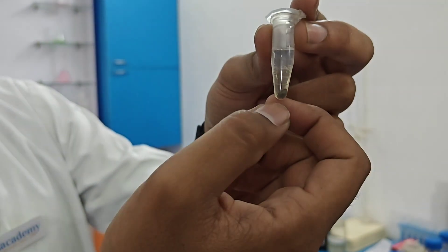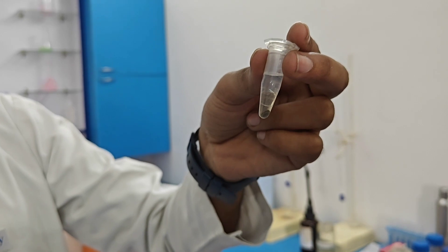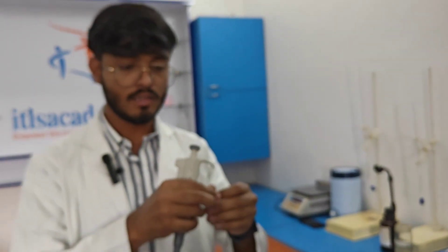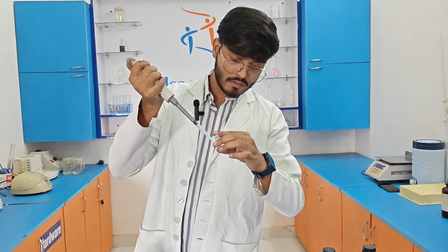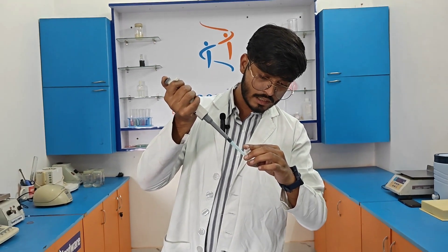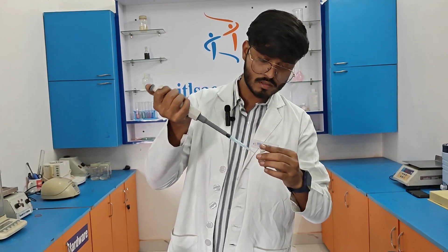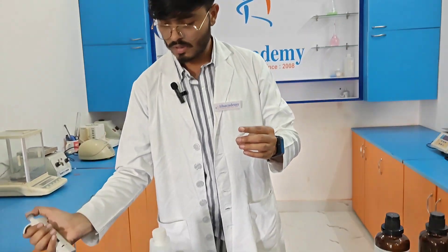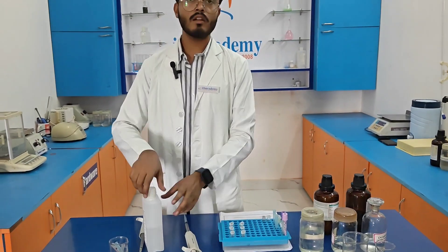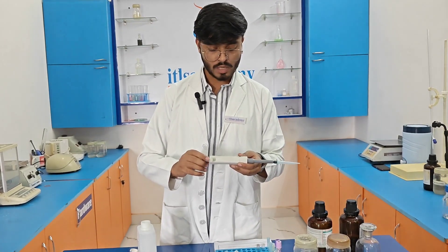The first layer, the second layer, and the pellet are visible. We need to separate and discard the upper layer very carefully so that the other layer is not disturbed. After discarding in the same manner, we are going to add 1 ml of absolute alcohol.